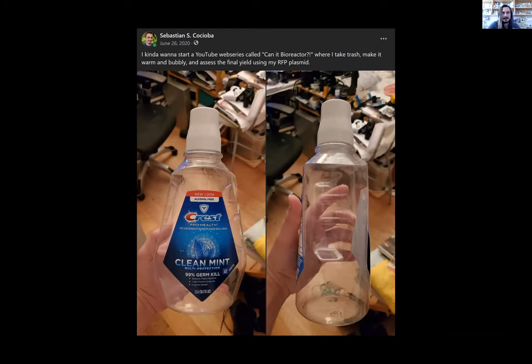I'm like, what if you take some heating mats and heat both sides to warm the bottle from the outside so you don't have any ingress inside, and then maybe use an aquarium pump or something to bubble, because in a bioreactor you don't need to stir the cells, you need to oxygenate the media. And so if you have an aquarium pump that bubbles air into the media, you're doing essentially what the stirring motion does. That's how fish stay alive, because the solubility of oxygen in liquid water is garbage. So you need to constantly sparge oxygen gas in order to enrich the water with oxygen. As in an aquarium, same thing for a bioreactor.